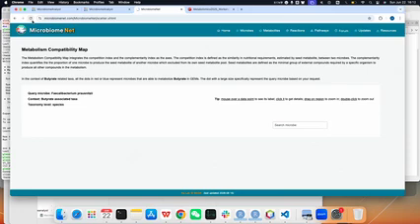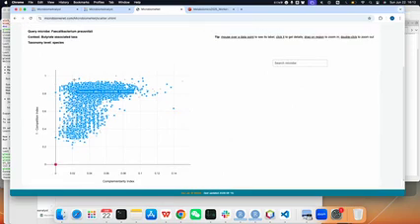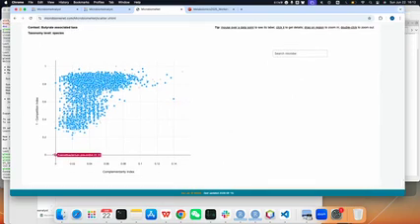Like we can see here. So this is the input species, and this is the one we have explained. We can see they have already been reported in the IBD study.